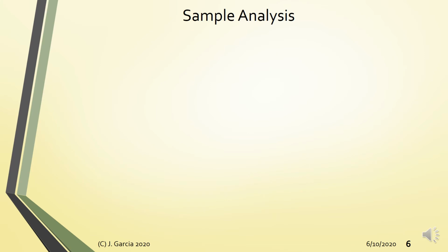Number one, sample type, kung solid, liquid, gas, or slurry. Okay, is it too opaque? Alright, sometimes if your sample is too opaque, transmission or transmittance measurement is not adequate. So you can use reflectance. So well, may pros and cons lang naman ito sa paggamit ng transmittance or reflectance measurements.